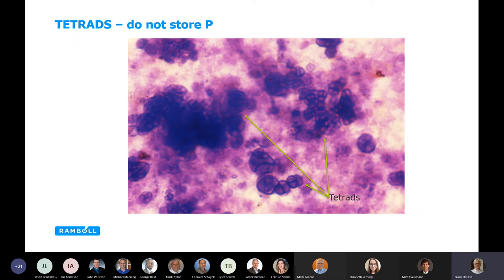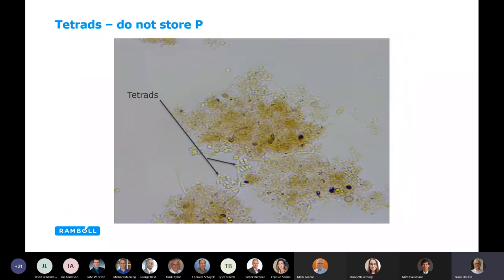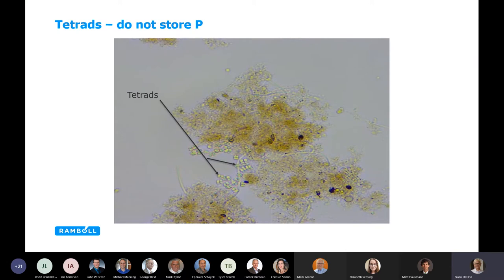When you see tetradiads — what we call GAOs — they do not store phosphorus. If you see these under the microscope, you can expect trouble real soon. They look somewhat like a baseball when stained, very easy to spot. In an unstained version they look like little Rubik's cubes, or tetrads. When you see these, you'll have two big problems: number one, this doesn't settle well at all; and number two, if you're relying on Bio-P, that indicates the competition has switched over to GAOs and phosphorus accumulation is not happening.